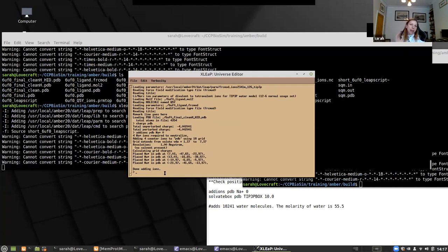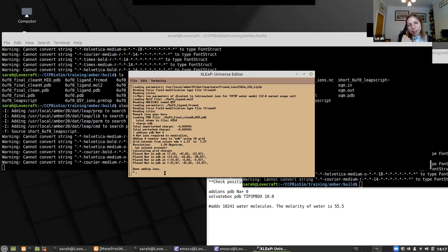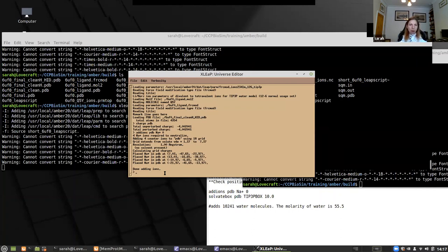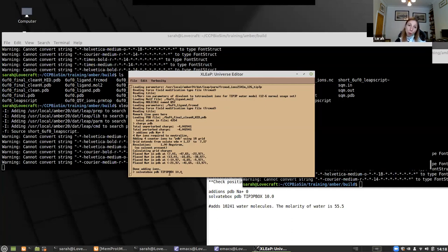Normally I'd add enough ions to bring it up to 150 millimolar. But LEAP is actually doing quite a sophisticated calculation when placing ions — it calculates the electrostatic potential around the molecule and places ions at the best positions — so placing a lot of ions can take quite a long time. Here I'm just neutralizing it. Now we add the water: 'solvateBox pdb TIP3PBOX 10.0' — solvate the molecule called pdb with a box of TIP3P water molecules, the most common water model, putting 10 angstroms of water around it.